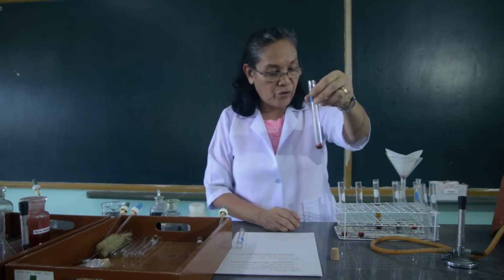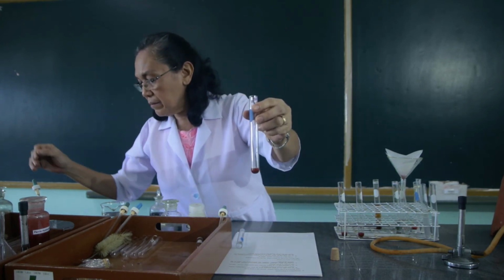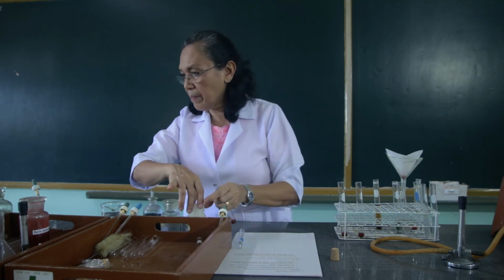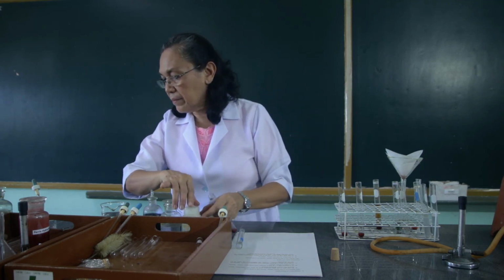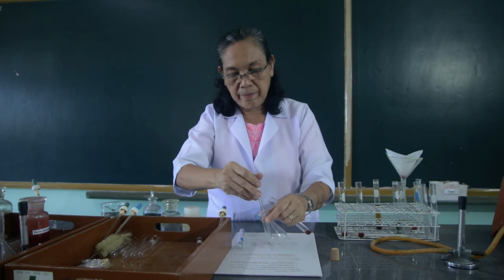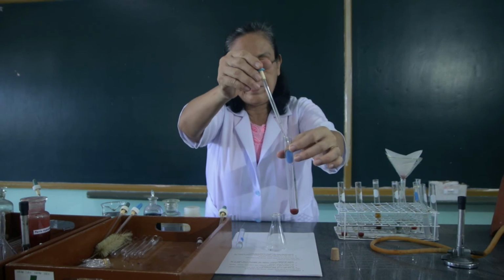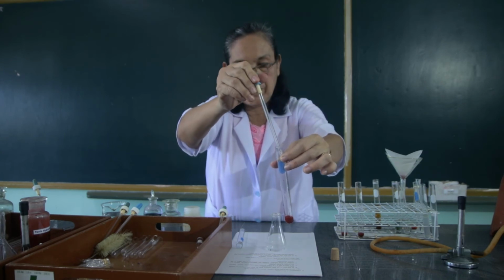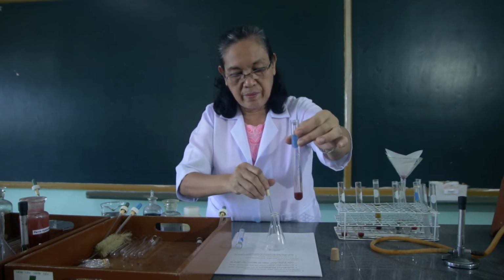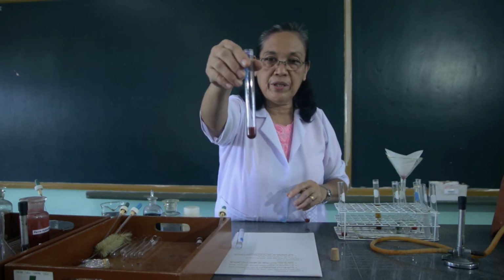To one of these test tubes, we are going to add 2 ml of the arsenic sulfide. And observe. Observe what happens.